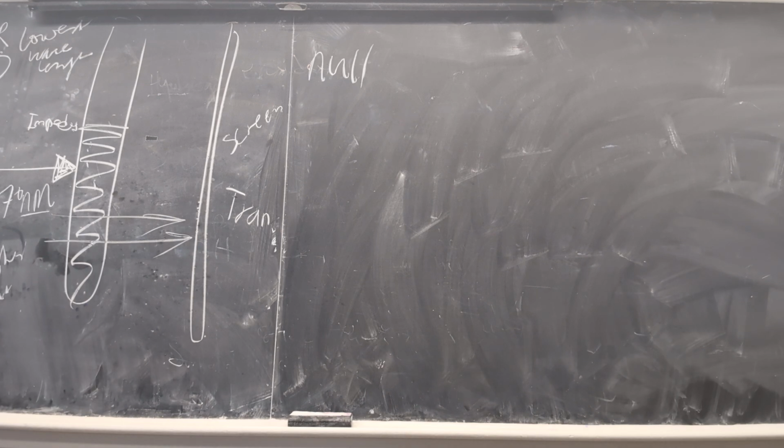We're gonna add a control vial with just water, but everything else is the same. I'll give you your enzyme supply. Where do you guys have a paper? Okay, that's your enzyme. What do you guys need now? Enzyme. We're making a control first. Okay, I'll give you the cap and put it on a Kim wipe. Do you guys have a Kim wipe? Let's get a fresh one.